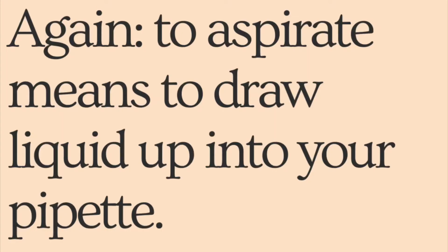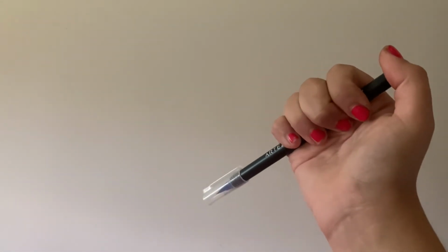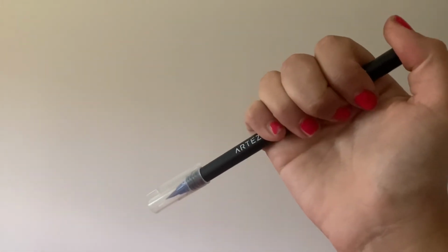When aspirating, you want to make sure you press the first stop before you insert your pipette into your sample. This helps to prevent air bubbles. When inserting your pipette, make sure you do so at a slight angle. Release the first stop, and the liquid will trickle up into the micropipette.